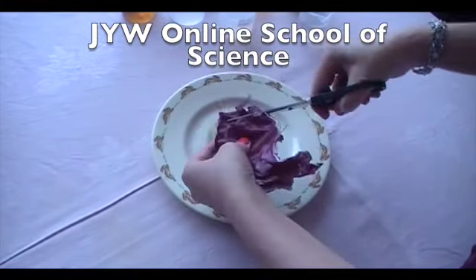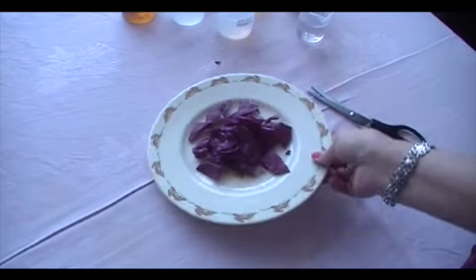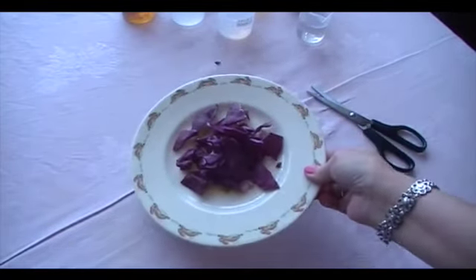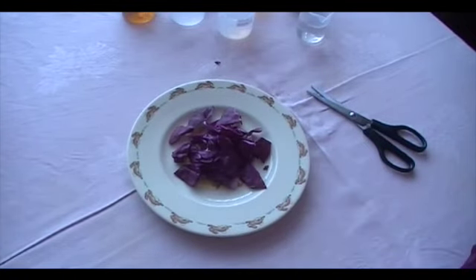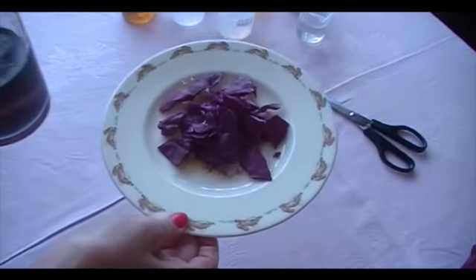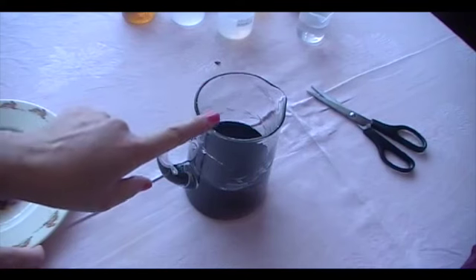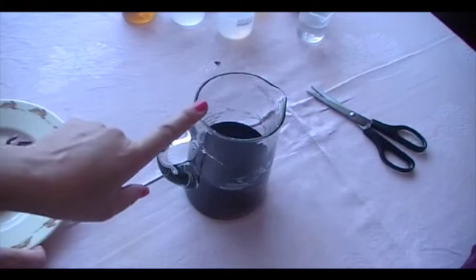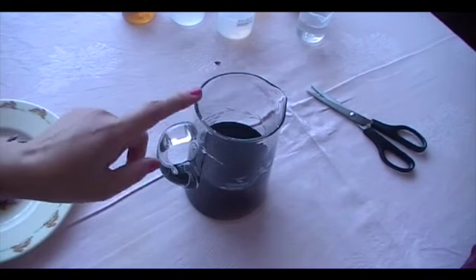And then once you've done that, you're going to put them into a pot. You're going to boil them, and you're going to make a solution. So that's it, I boil the red cabbage and I made this solution. And that can be a very good indicator to test whether a solution is acidic or alkaline. Let's give it a go.